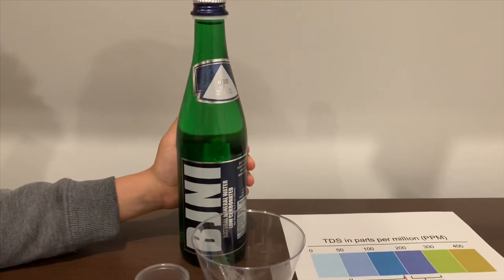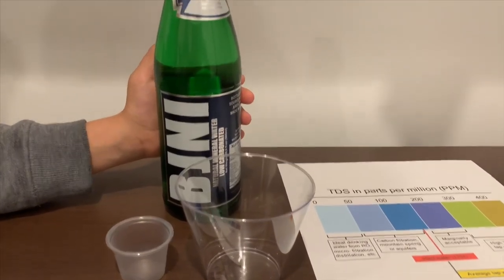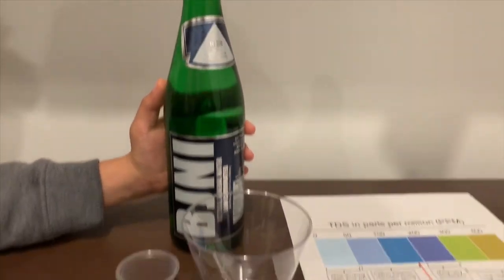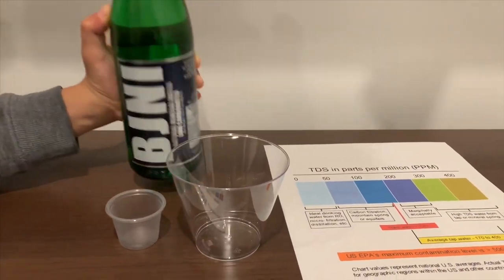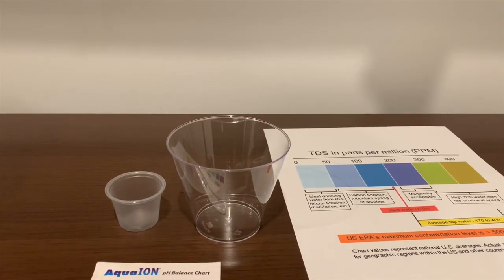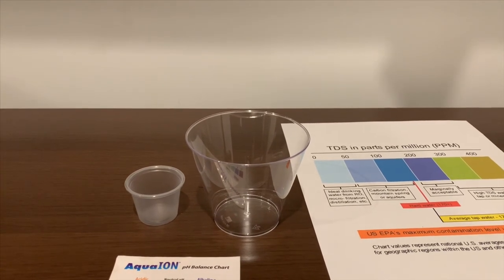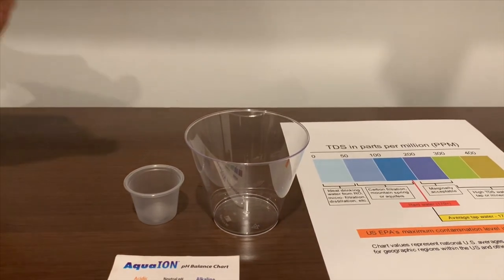This is Bjni Natural Mineral Water. It's sourced from Romania and it costs 99 cents. Let's test the pH and TDS levels. Let's pour some water in.